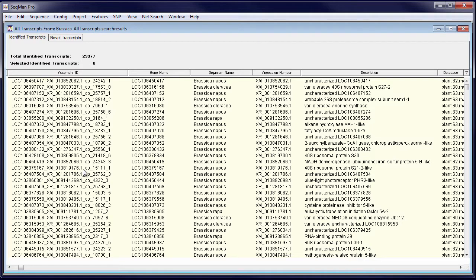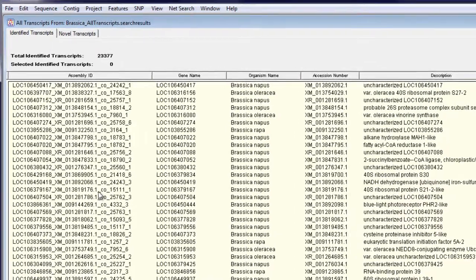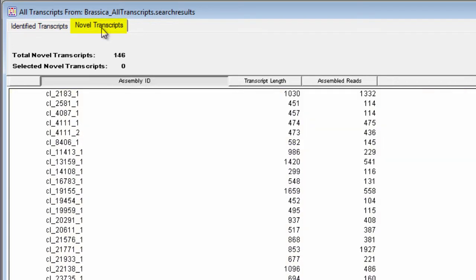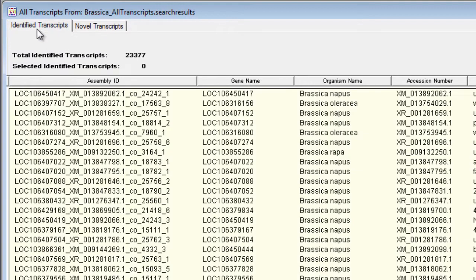After assembly, open the transcriptome package in SeqMan Pro. Here you'll see a report of all the assembled transcripts, grouped into two tabs: identified transcripts, which match genes from the RefSeq database, and novel transcripts, assembled de novo without a reference.